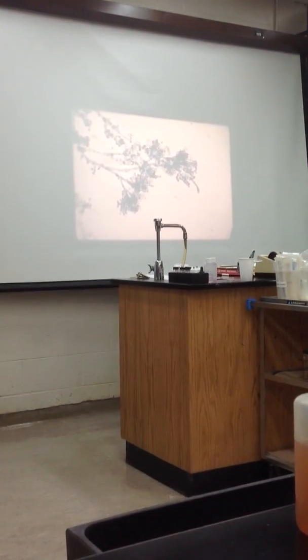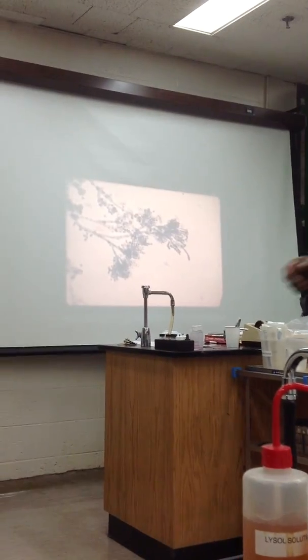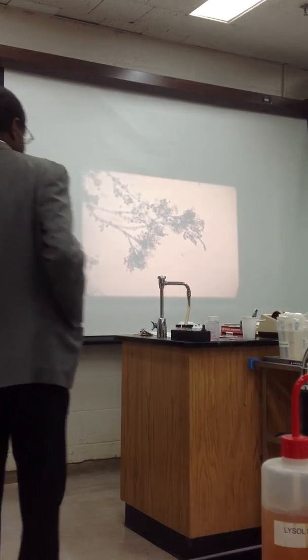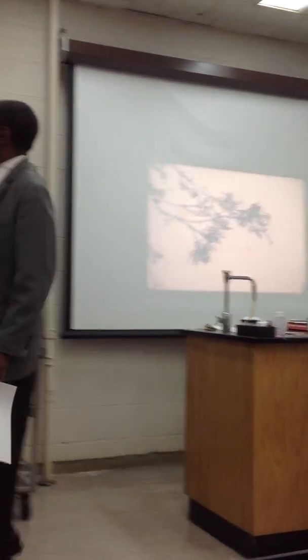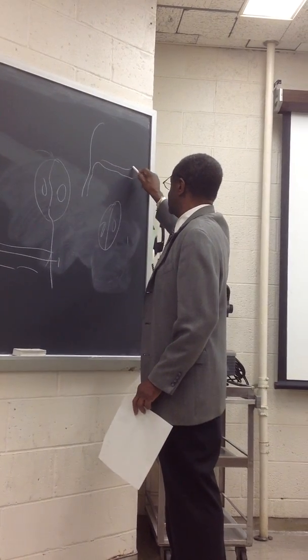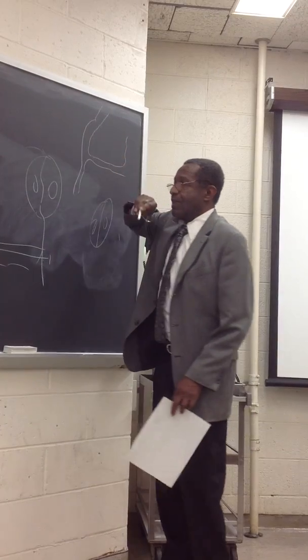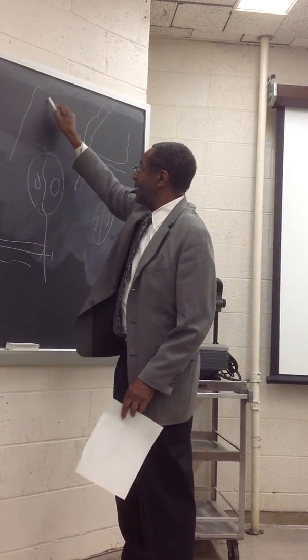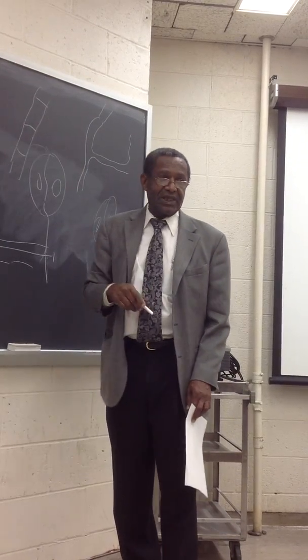How do you tell septated from non-septated? If you look at the non-septated fungi under the microscope, as opposed to a septated fungi, with a closer look at the septated one you see individual cells of the mycelium.